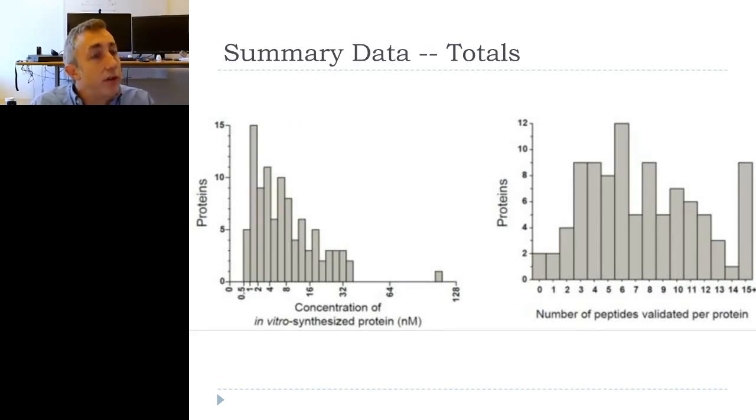All the proteins are fused to GST, so we were able to use peptides from GST to quantify the amount of the produced gene product. There are not a lot of proteins actually produced, but still there's plenty to measure by mass spectrometry to work out this assay development.